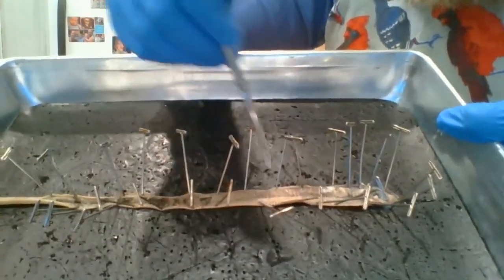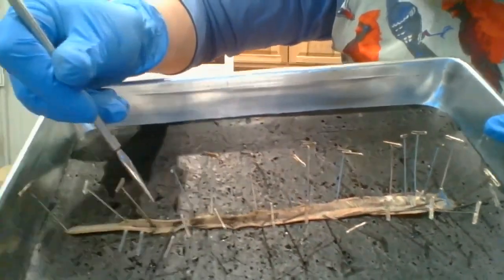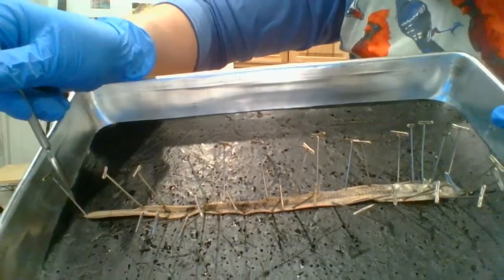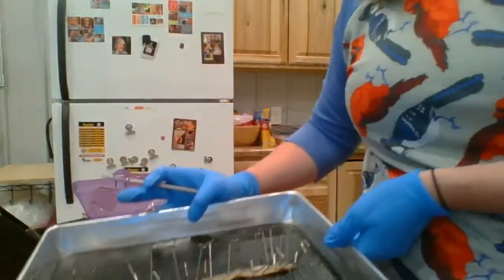and then it'll go to the intestine. The intestine is going to absorb the nutrients. It's going to go to the bloodstream. It's going to go down the intestine and then out the anus as worm castings, or poop. Just a quick review here.